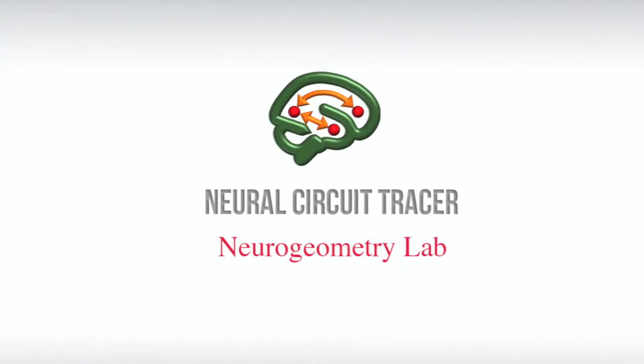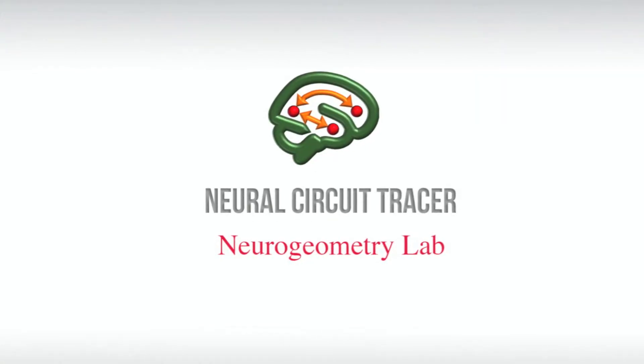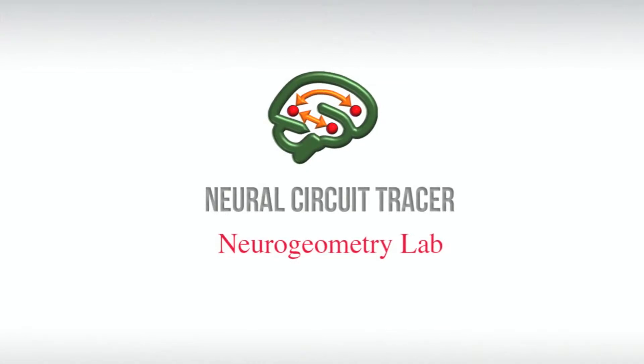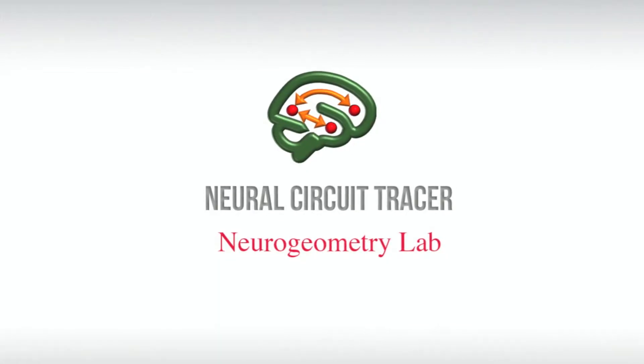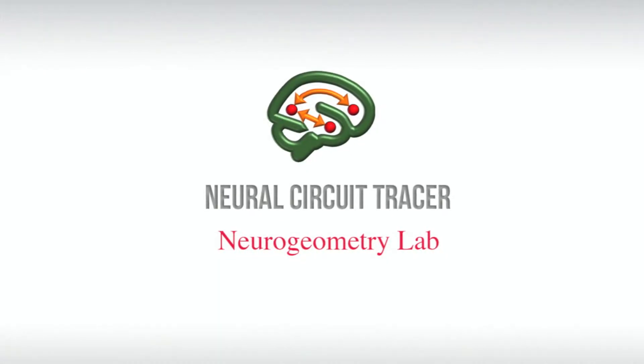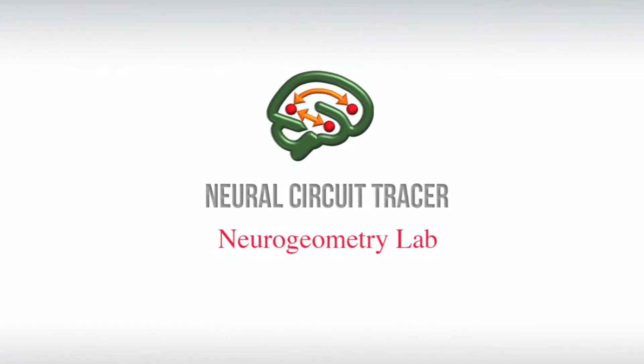Neural Circuit Tracer is software for automated and manual reconstruction of neurites from light microscopy stacks of images. This video is an introduction to the basic functionality of the software.